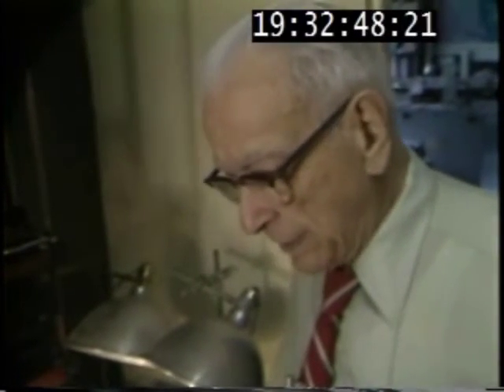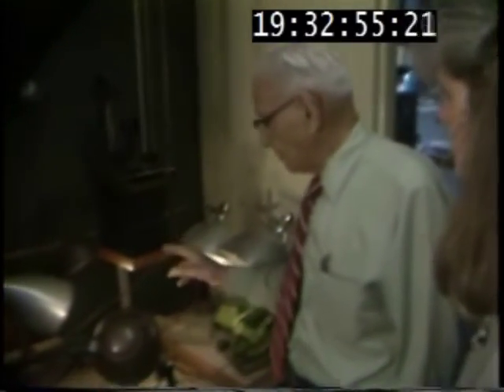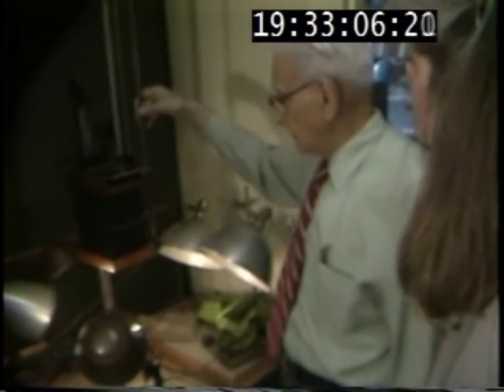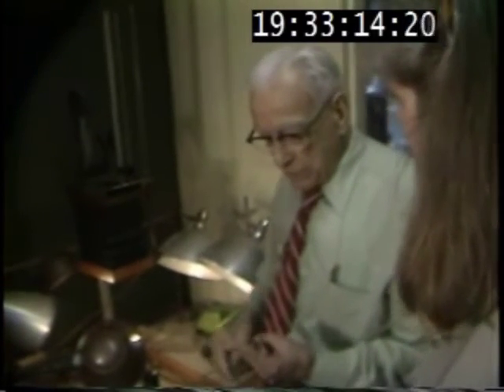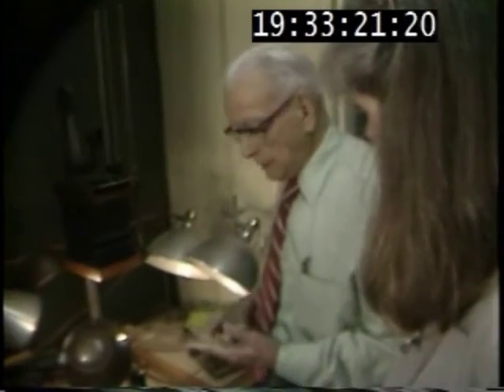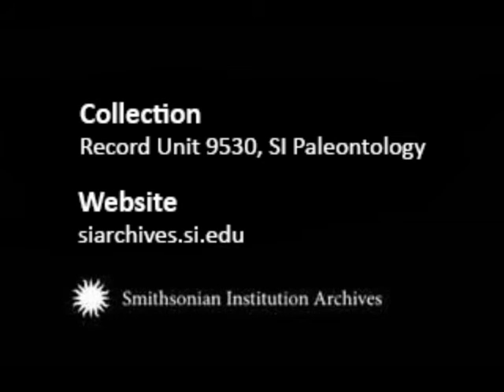If we have interiors, depending on what detail we want, we'd probably enlarge — two is common. With a fairly large specimen, I can get one and a half and up. With this setup, a 120-millimeter lens, I can get X3 here. There would be two normal views, one of the ventral interior and one for the dorsal interior. And then there might be parts of those that we'd photograph, so we could have up to 10 or 15 pictures.